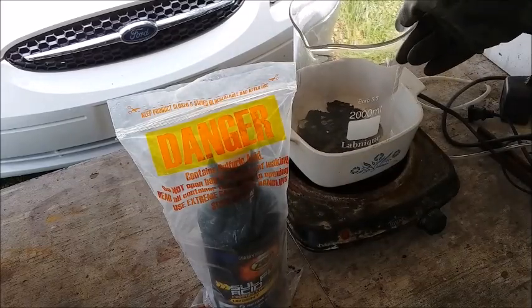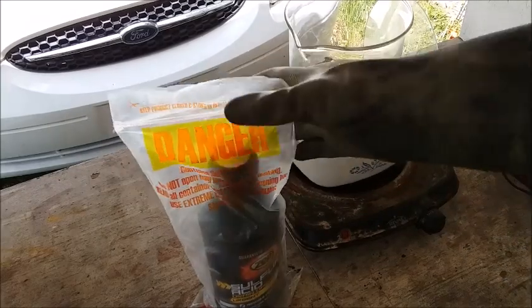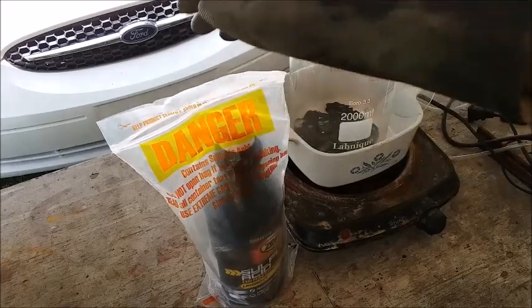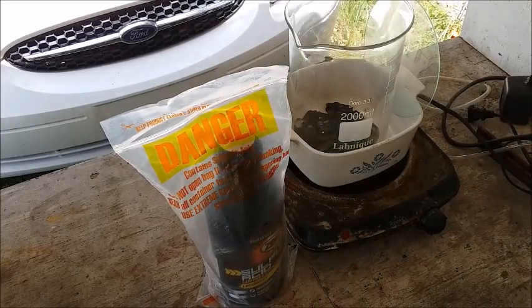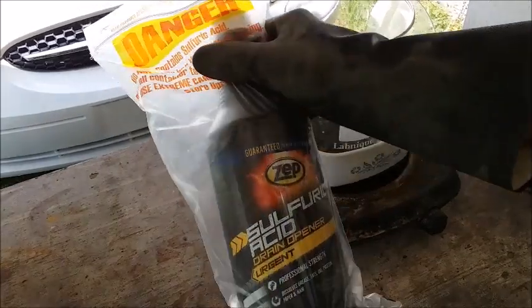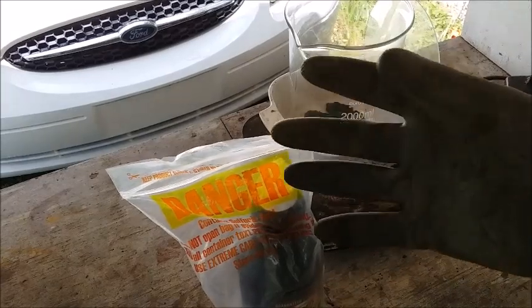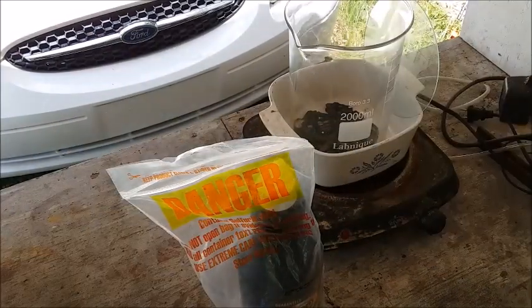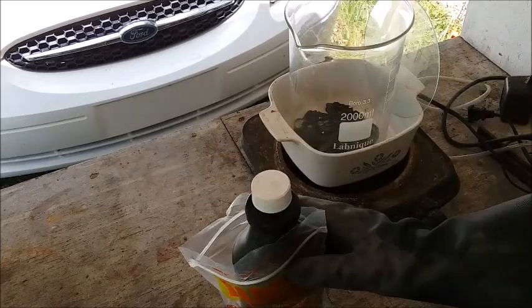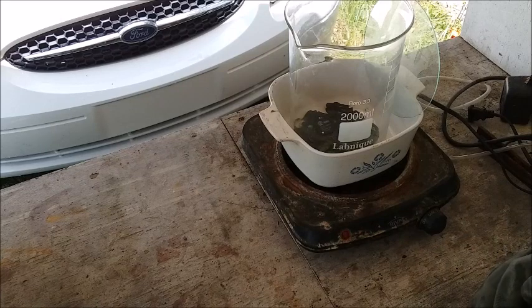And I've got them in a pretty big beaker because this could foam up some. We're going to use sulfuric acid, concentrated sulfuric acid, drain cleaner, or drain opener, which should be available to most people, most places. I don't know about other countries, but in the U.S. you can find it lots of places. Concentrated sulfuric acid, nasty stuff. Wear your PPE with this stuff. It's nasty. It will burn you. I know. I have scars. Trust me. Let me serve as your bad example.